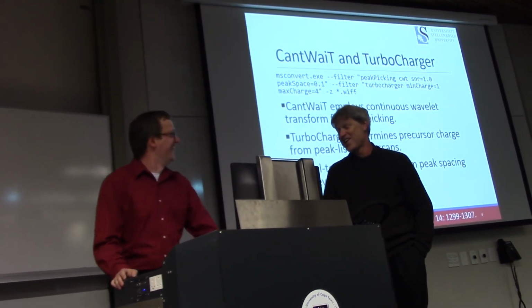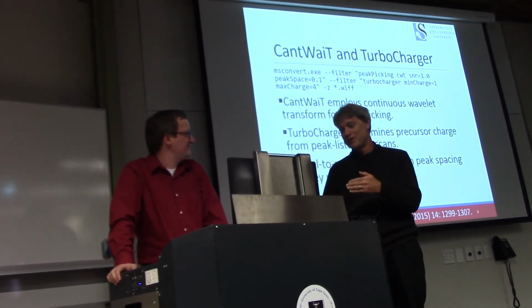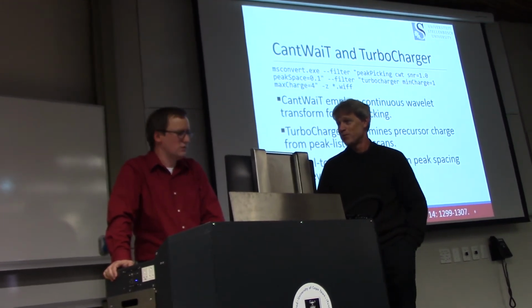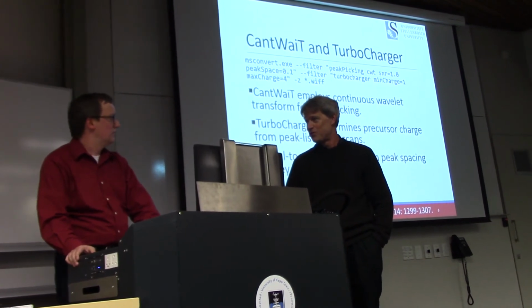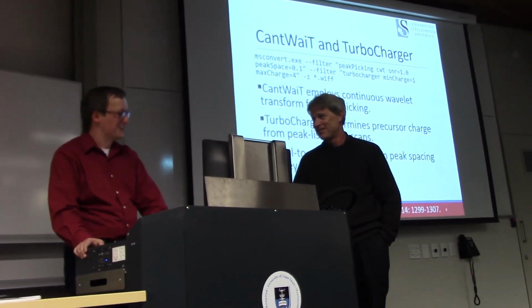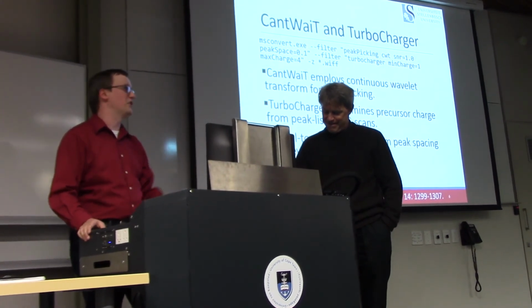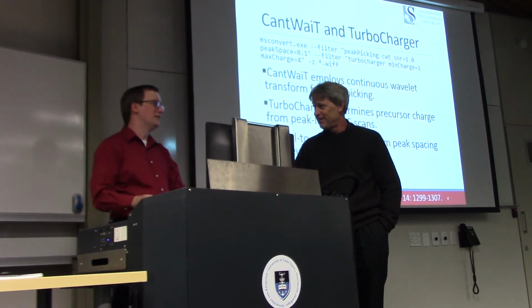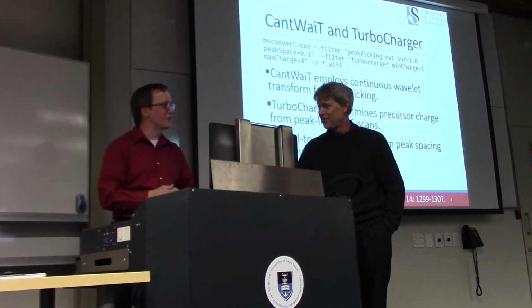And so that's my question really, whether we do in practice see past the limit of the more abundant proteins or not. I mean, in theory we should, but whether we do remains to be seen. Sure. But any time you have a new technique that doubles your identification sensitivity, whether it's on the instrument side or the informatics side, the gains primarily fall on proteins we've already seen.